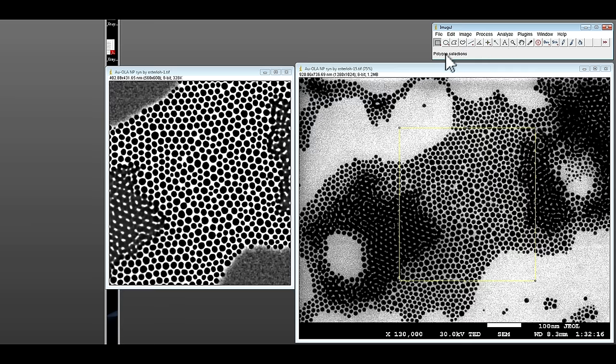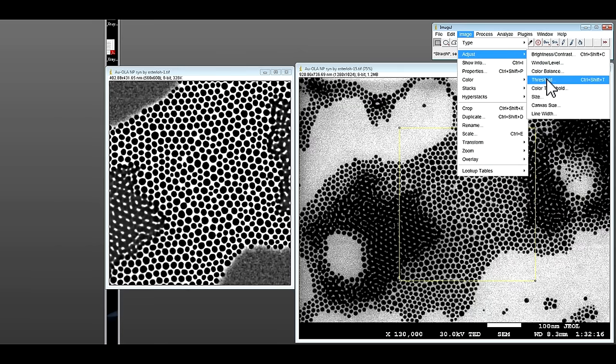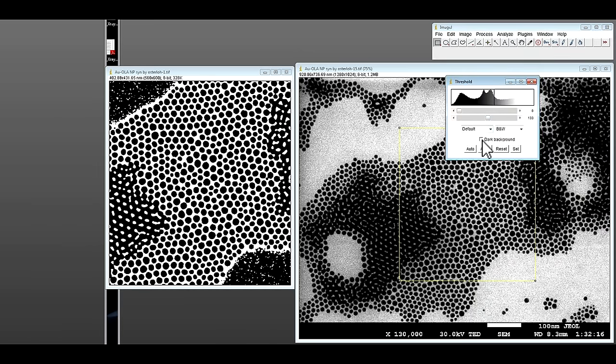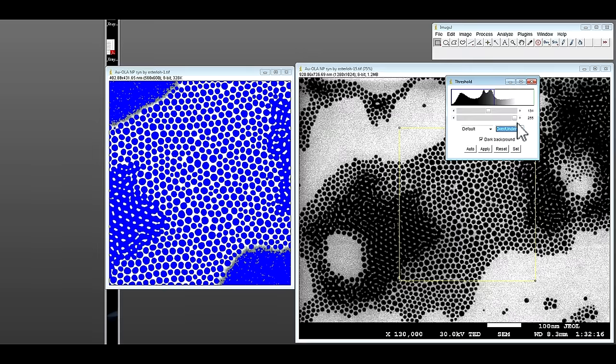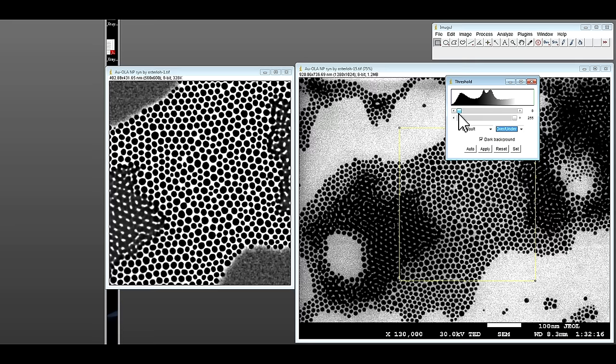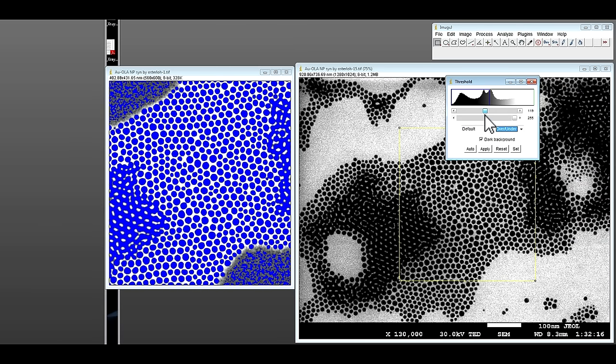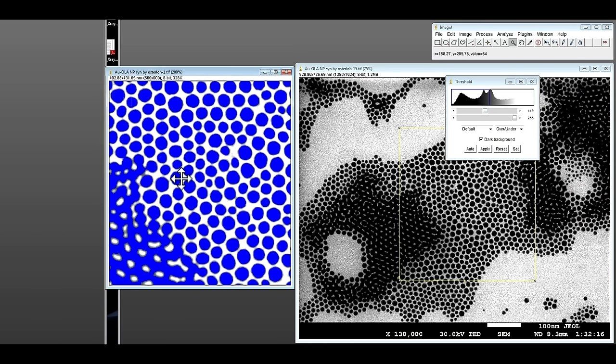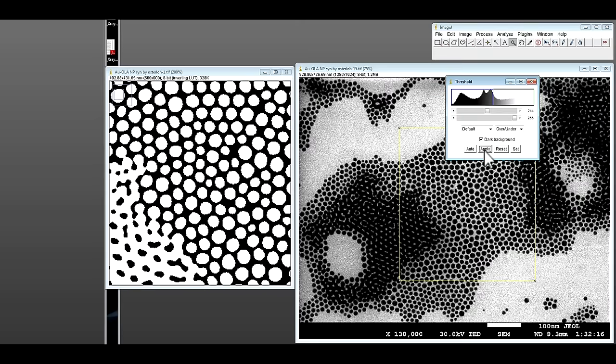And then we can threshold the image, and you can see this is our original size of the nanoparticles. And to what extent is OK to threshold, you can even zoom into the image. And this looks, that's about right. You can apply.